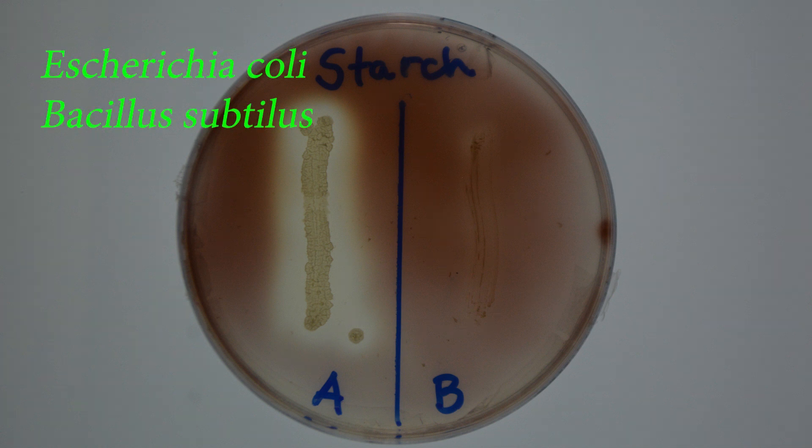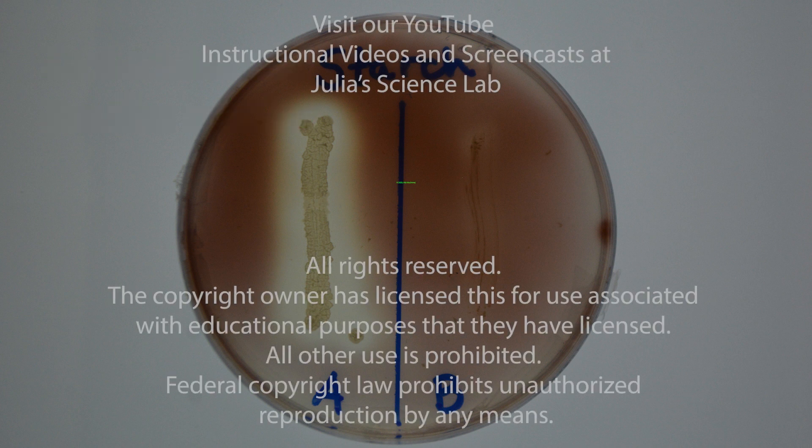The bacteria that were placed on the medium were E. coli and Bacillus subtilis. E. coli is amylase negative. Bacillus subtilis is amylase positive. Which of these is A, which of these is B, and which one was able to hydrolyze the starch? Record your results on the lab report.